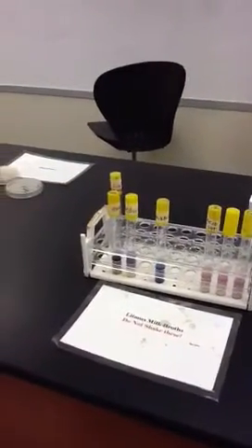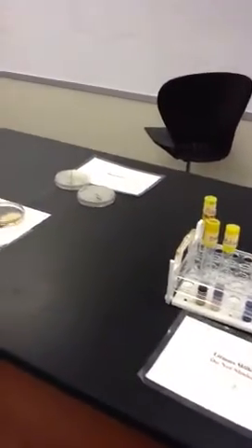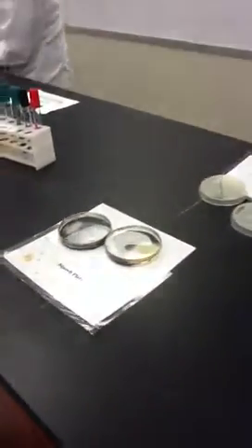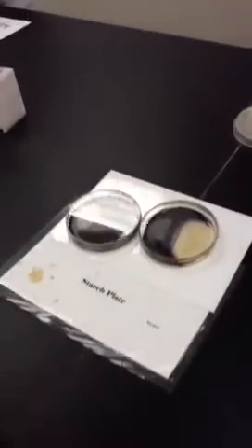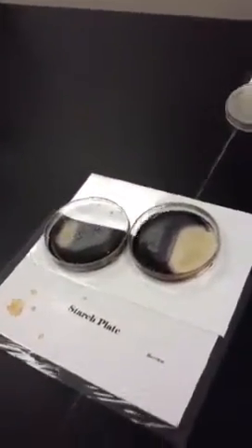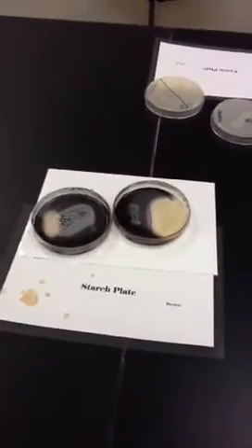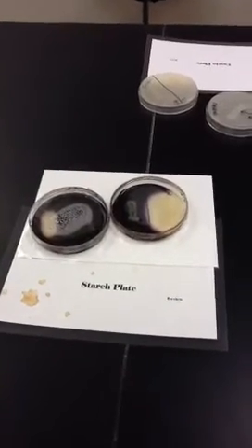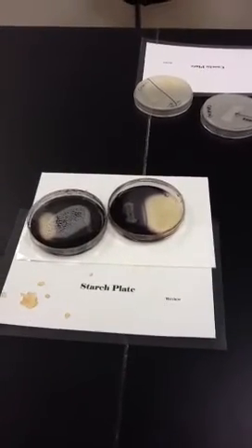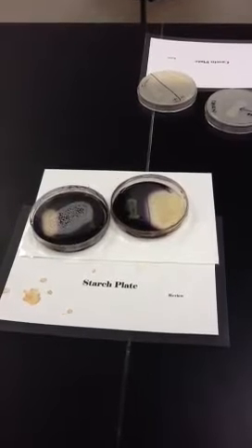Then we've got the starch plate. I don't know. I'm going to email you this. Don't stress. What did you put in the starch plate after you grew it? Iodine. Correct. And what is the point of that? To see if there's a breakdown of amylose. Because iodine will be absorbed by the... Iodine will... DNA? No.